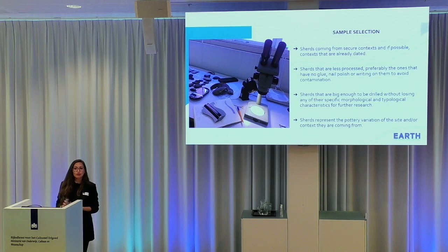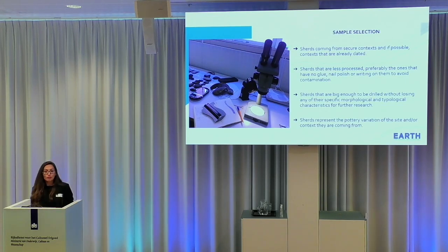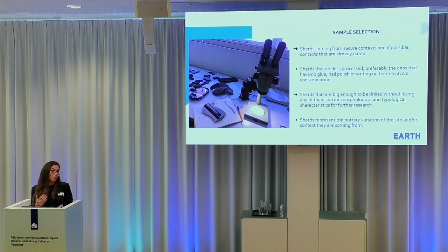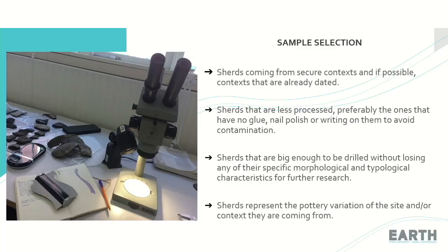We are coming to the sample selection, which is very important for the research, because if we just select something to be analyzed, we're just going to get random answers, but what it means really depends on the archaeological context of the pottery. So I can give you 4 main criteria for this that you can apply if possible, and if not, then we can discuss more possibilities.